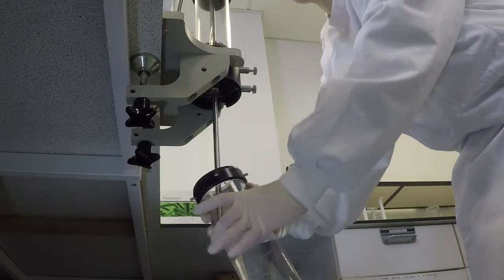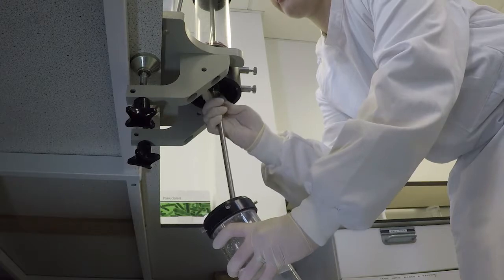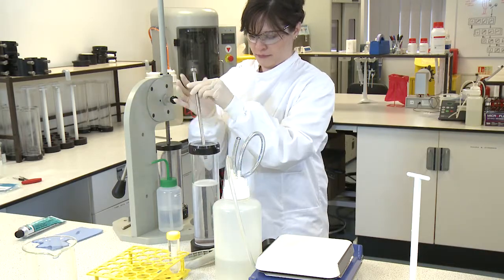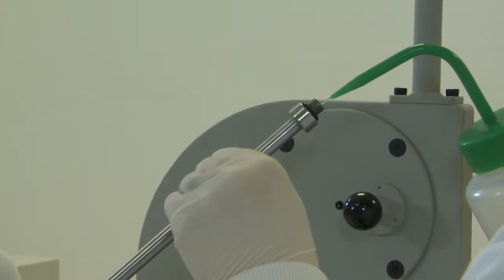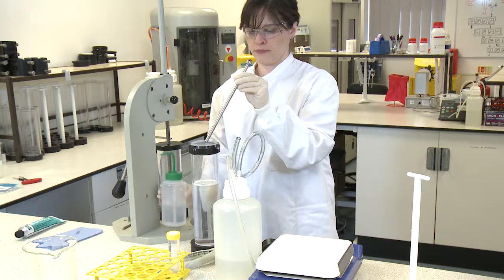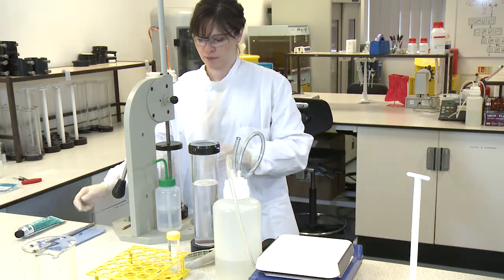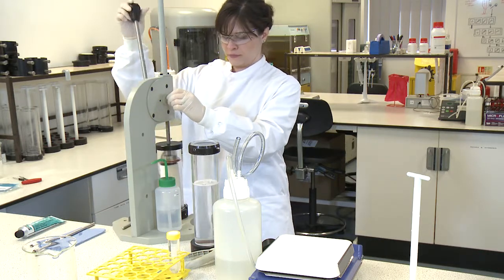Begin to dismantle the tubing set. Rinse the inside of the steel tube with PBST, adding the rinse volume to the assembled concentrator tube. Return the plunger head to the upper position.